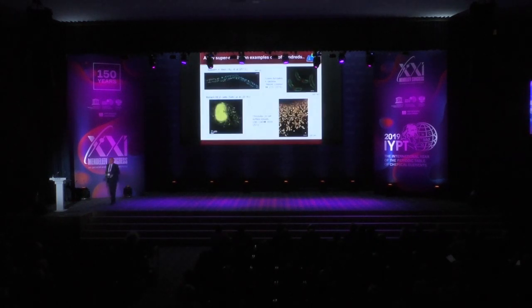Another class of examples, and there are just too many for me to review because there are hundreds now. This is a case of mammalian cells in part of these pictures. On the upper left is a spectacular demonstration of something that was discovered by this super-resolution microscopy, which is the periodic banding of the spectrin molecules in an axon, from the Zhuang lab.